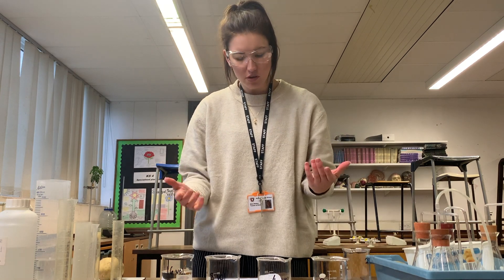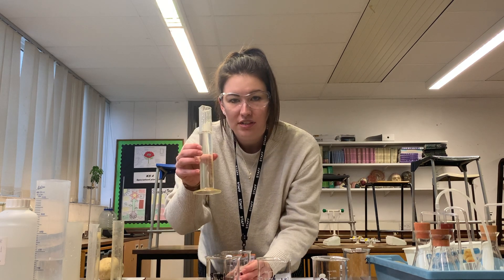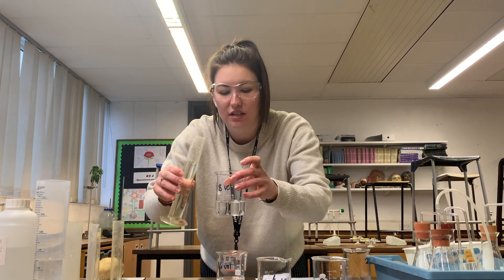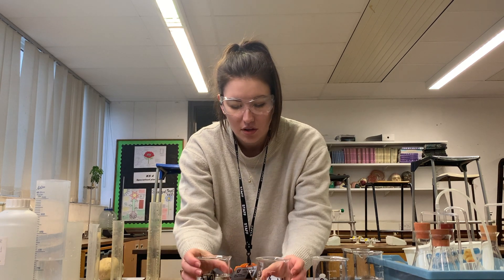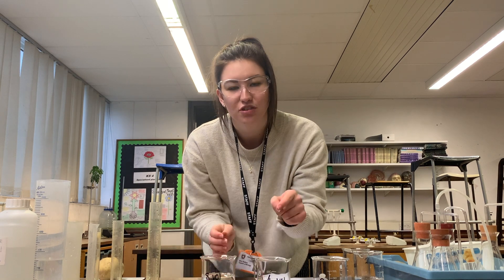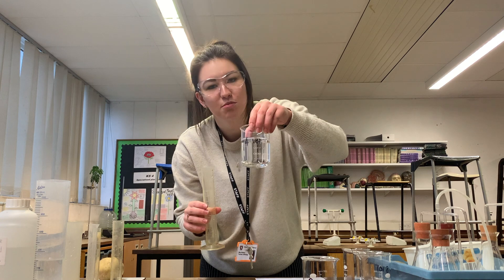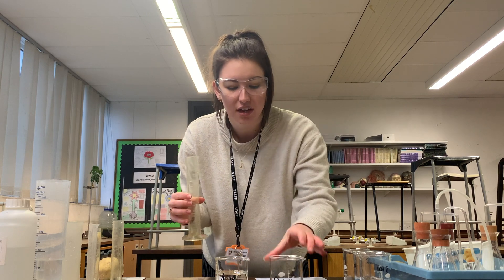This is 100 centimetres cubed of our 16 vol solution going into our 8 vol beaker that already has 100 centimetres cubed of water in it. Next we need to pour 100 centimetres cubed of our 8 vol solution into our 4 vol beaker that has 100 centimetres cubed of distilled water. Last of all we are going to pour 100 centimetres cubed of our 4 vol solution into our 2 vol beaker that has 100 centimetres cubed of distilled water in it.